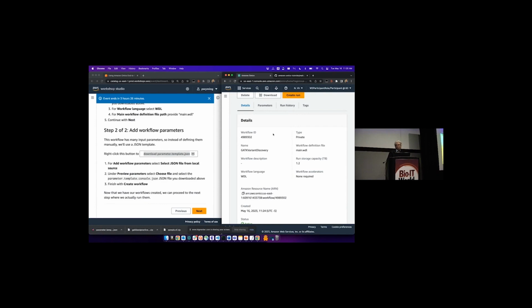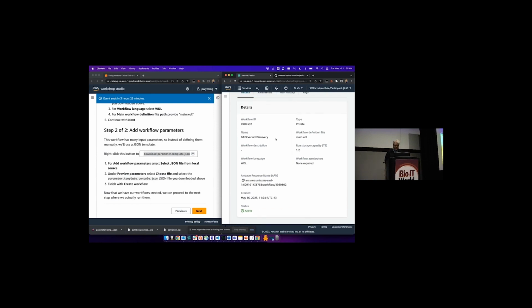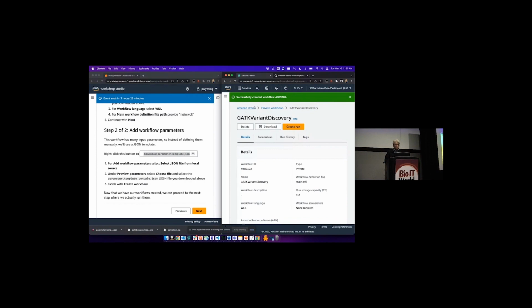Oh, that's left the... Which one is it? The NF, the Nextflow one, or the? Yeah, it'll be both. Okay. It should work. I noticed this issue with a customer a while back. It's a weird Windows thing. I don't think it's doing either. I think there's something weird in the browser.